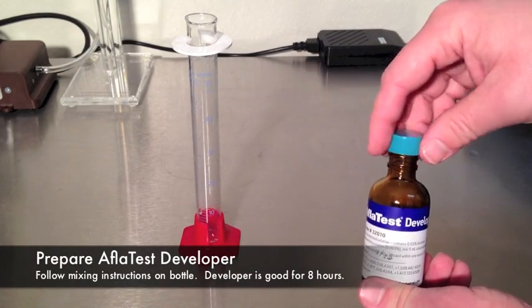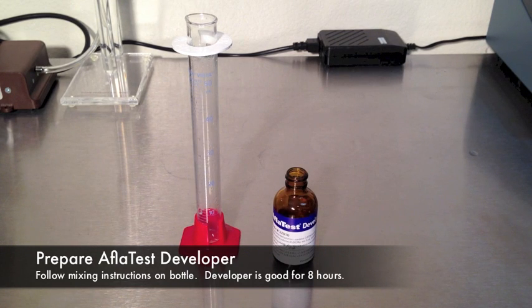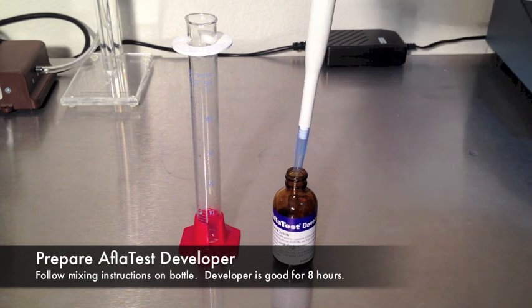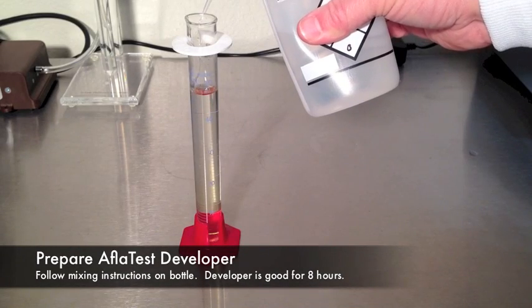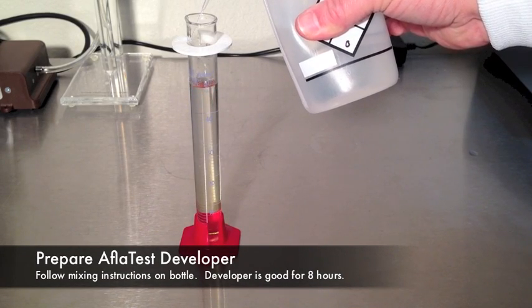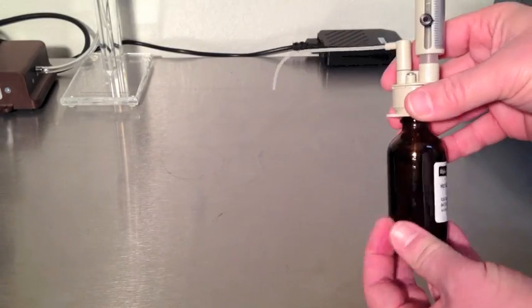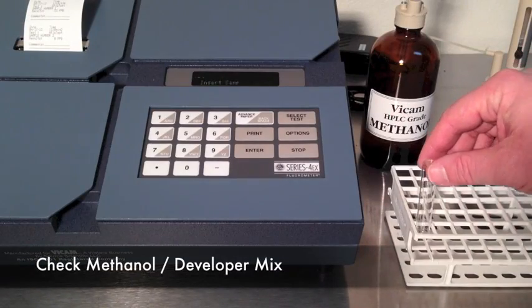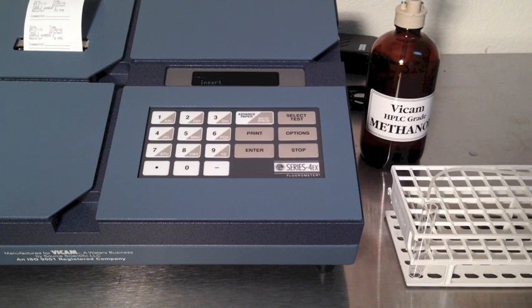Prepare AFLATEST developer. The developer is good for 8 hours. Follow the instructions on the bottle for mixing. Mix 5 milliliters of developer with 45 milliliters of purified water. Check your developer. In a new cuvette, mix 1 milliliter of developer with 1 milliliter of methanol.